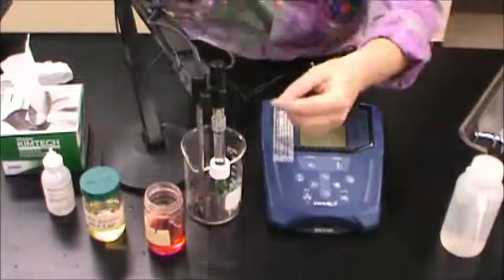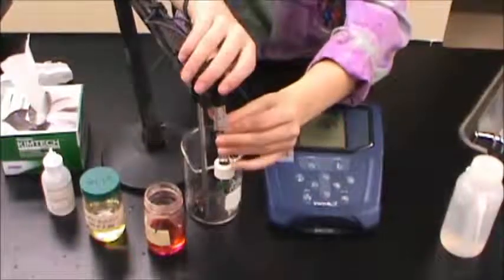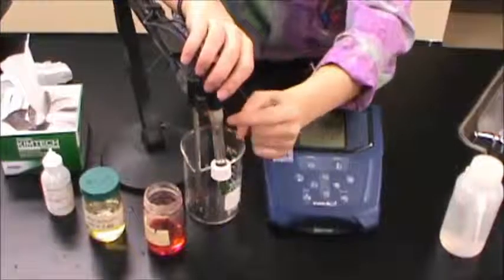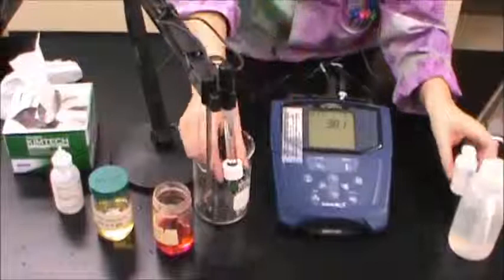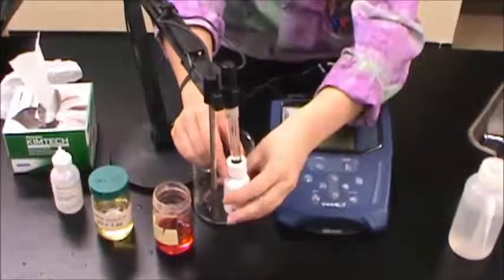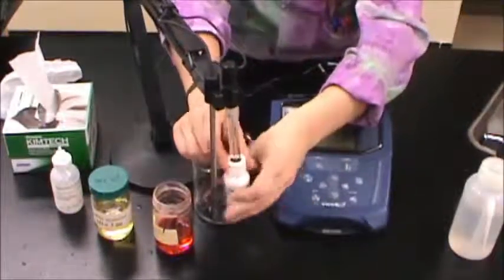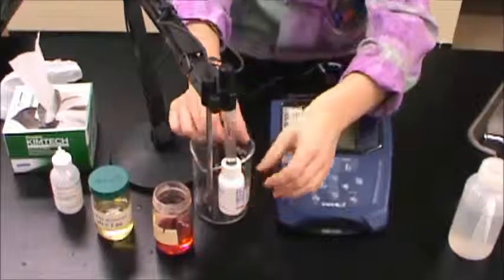Also make sure to move the band around the pH electrode so that the vent hole is covered back up. Finally, replace the bottle of electrode storage solution on the end of the pH probe. The instrument can now be turned off and returned.